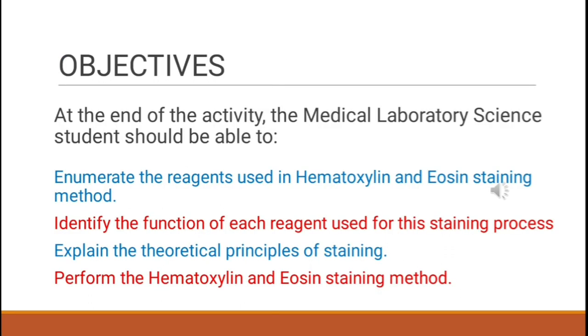For our learning objectives, you are going to enumerate the reagents used in hematoxylin and eosin staining method, identify the function of each reagent used for the staining process, explain the theoretical principles of staining, and perform the hematoxylin and eosin staining method.